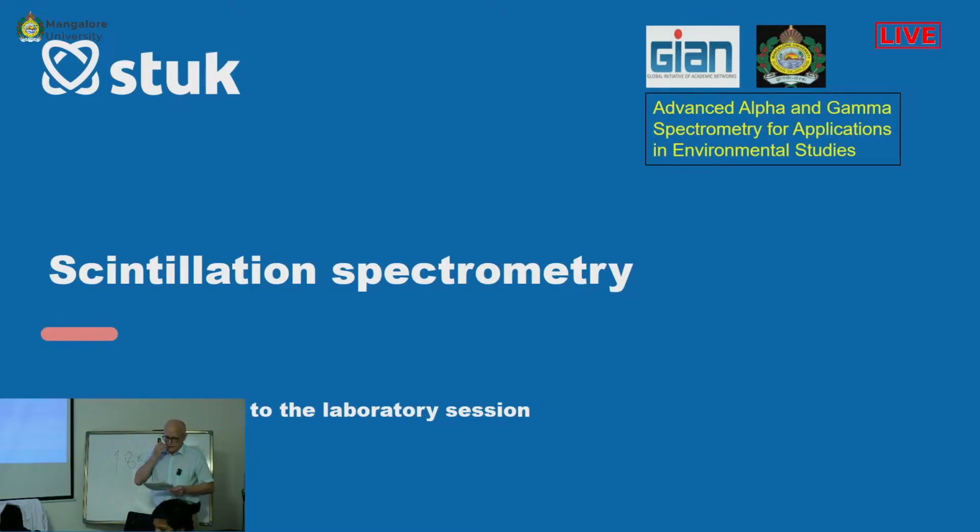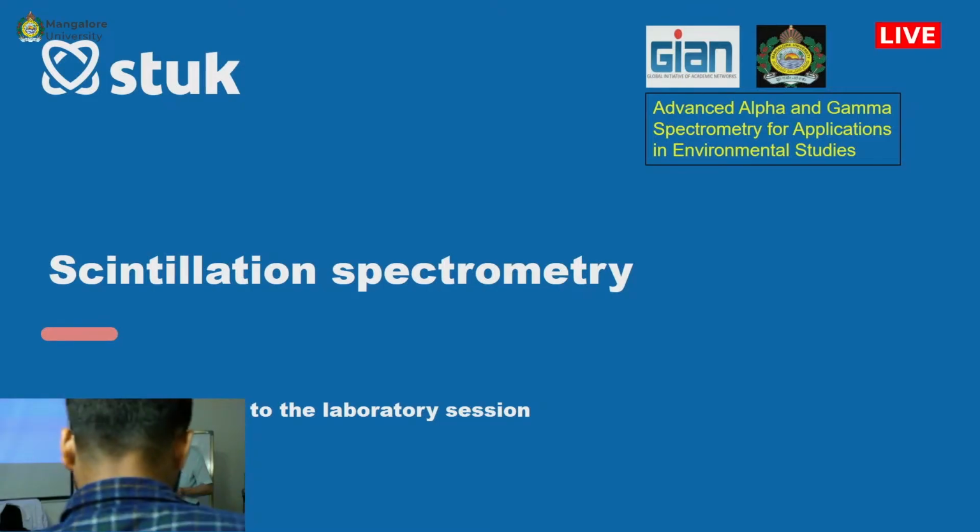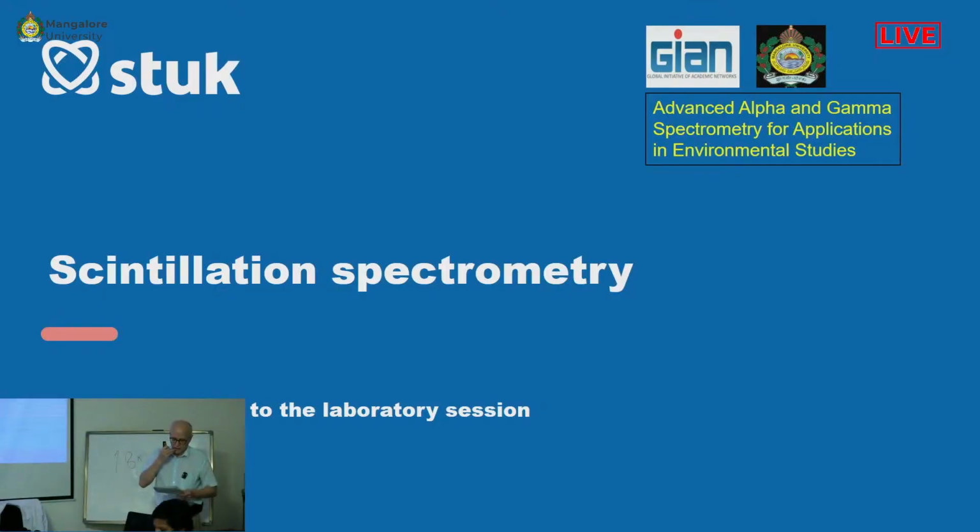All right. I want to show you some slides regarding scintillation spectrometry. This is only a brief introduction to the lab session.